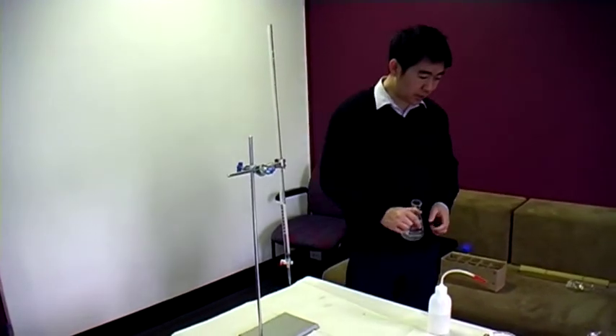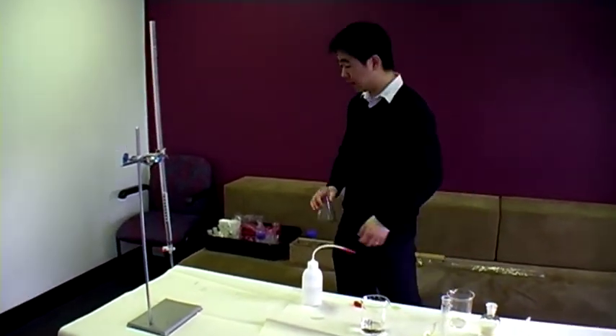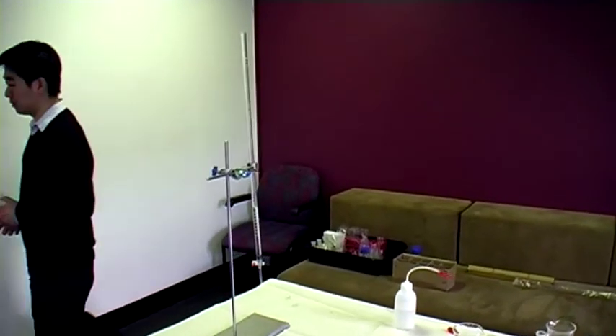That's a good sign — it means our rough titer was very, very accurate. We got it down to the single drop. We'll rinse this and start again.